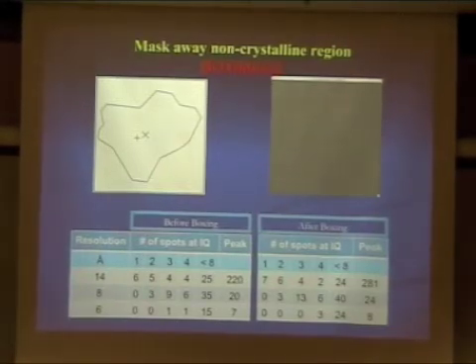Okay, this has to do with you looking at a smaller area, so you have fewer unit cells contributing to that intensity. But if everything goes right, the part of your box contains higher resolution information. In other words, when you start to look at the spots at higher resolution, they should improve. Okay?